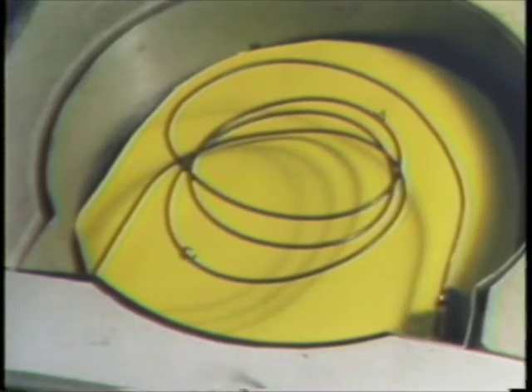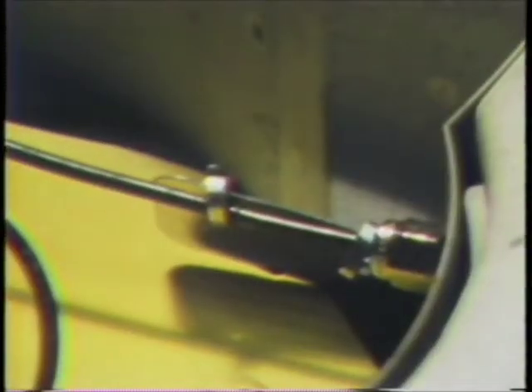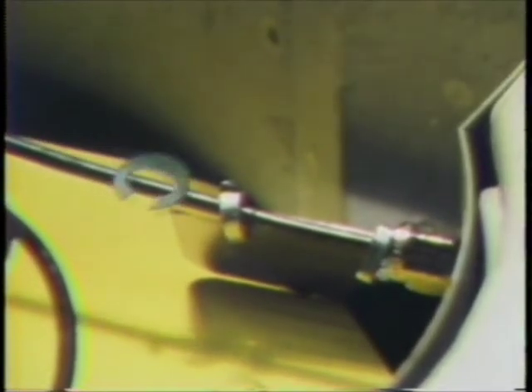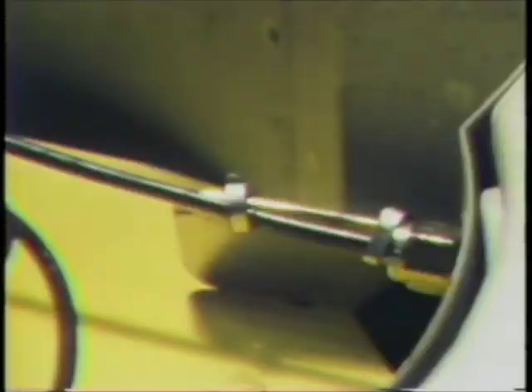When a band of purified material exits the tube, a detector records its presence on graph paper as a function of the time on the column, called the retention time. If a known sample of DBCP has the same retention time on the gas chromatograph as substance C, then compound C may be DBCP, or it may not.